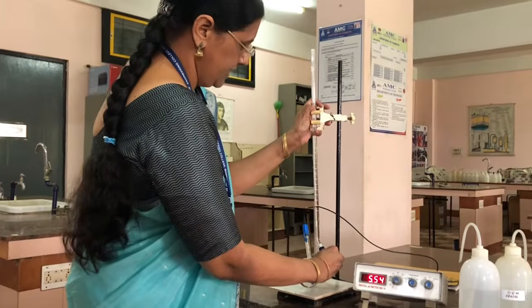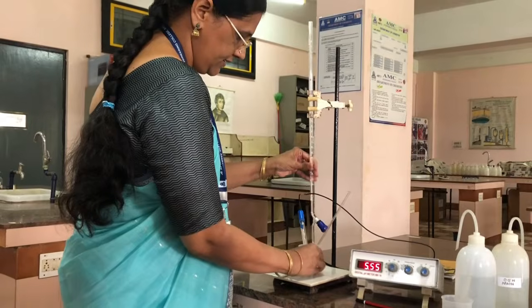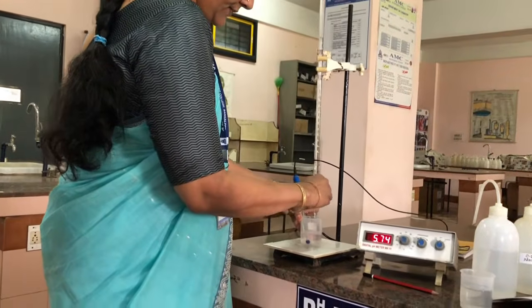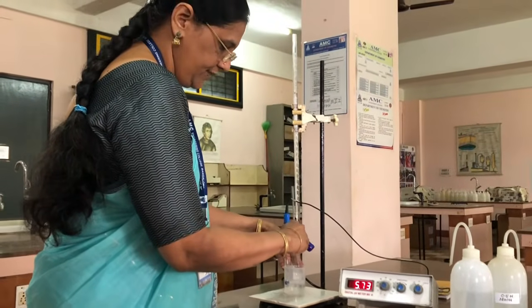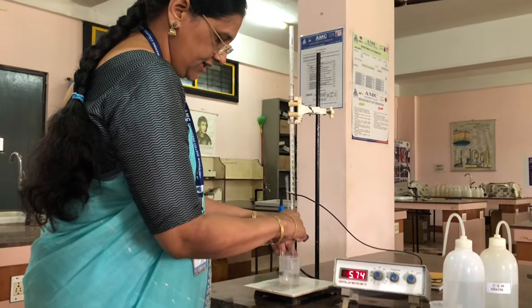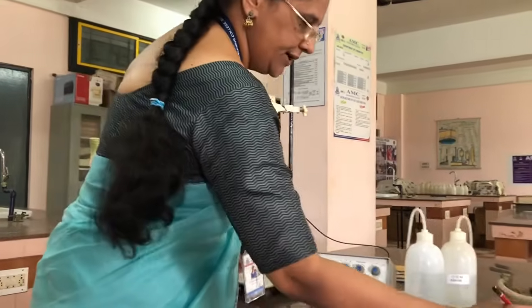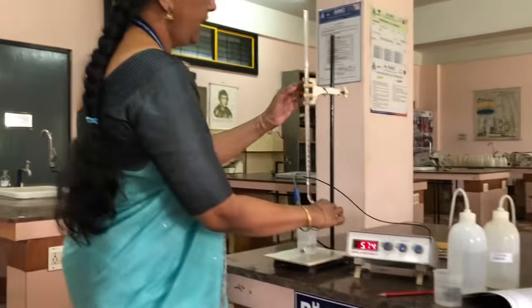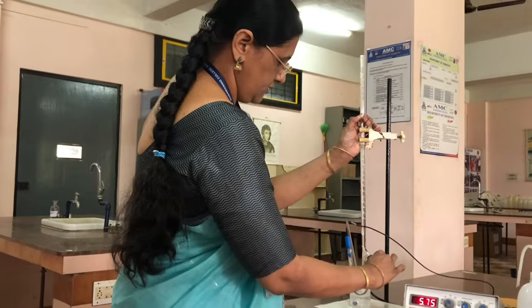Again we have to add 0.5 ml of sodium hydroxide from the burette and shake the solution well. You should be very careful when shaking. See that the glass rod should not touch the glass electrode. Now it is showing 5.74. Now again I am noting down, and I am adding 0.5 ml.